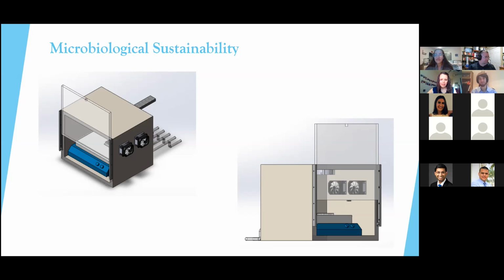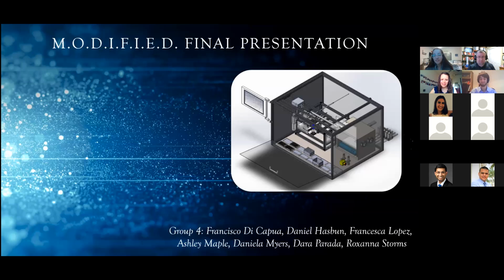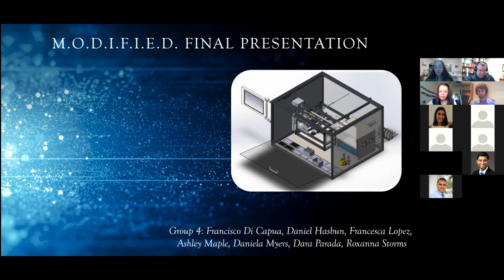Can you guys go to the XY gantry slide where you depict the XY motion, the very first one, I think it was? Yeah, I was going to say that's probably our first slide. Are you guys at all concerned about the large cantilever beam that you have, both the one for the syringe and then the one that picks up the well plates that you're creating at the top point? Because you're essentially making a giant cantilever beam that you're swinging back and forth on your gantry as you move it, because you're going to create a lot of momentum in order to have to stop it accurately.